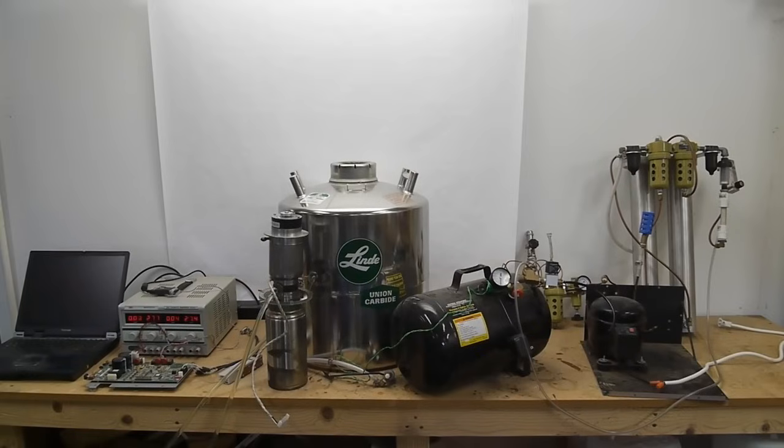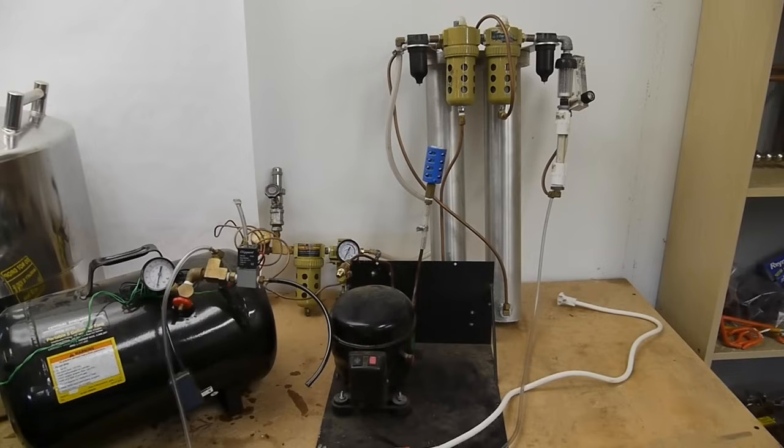So let's start on the right side and we'll talk about the nitrogen generation system. The purpose of the components that you can see here is just to generate a dry nitrogen gas source. So you could actually replace all of these parts with just a cylinder of nitrogen.